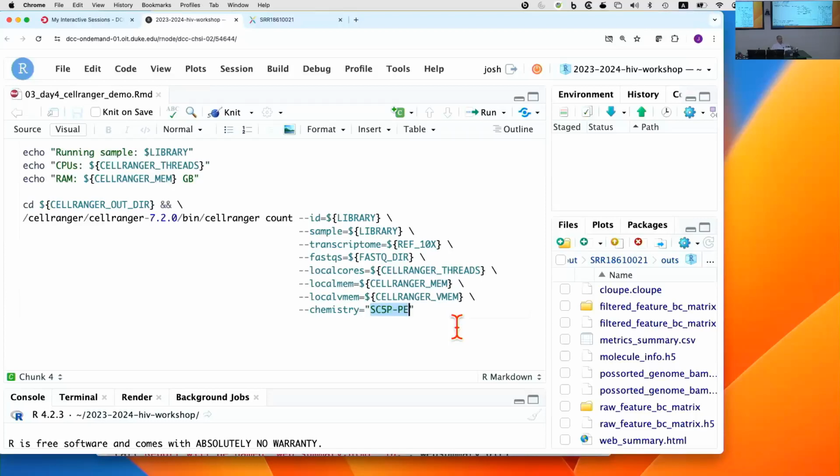So we've got 17 minutes left. I'm going to try and stop at 3:50 so that you have a little bit of time to fill out the survey. We have two options for the next, say, 6 or 7 minutes. We can talk about the answer to my question about how you get all the cell barcodes on a given bead to be the same. Or I can talk a little bit about, I told you that this isn't exactly how we would normally run Cell Ranger on the cluster. I can tell you a little bit more about how we would actually really do it.